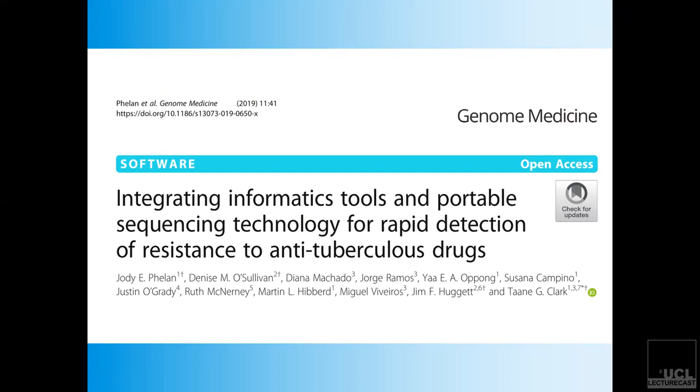Also, besides the databases, there are now more pipelines, which make bioinformatic analysis easier. Previously, you literally had to do everything by command line, each step. This will do the alignment. These are bad sequences, I need to do some trimming and filtering. Then I need to do the calling of the variants, the annotation, et cetera. But now all of those different tools are stitched together. So you put in one input, you run it, and you get a particular output, which is more feasible. So these have increased.